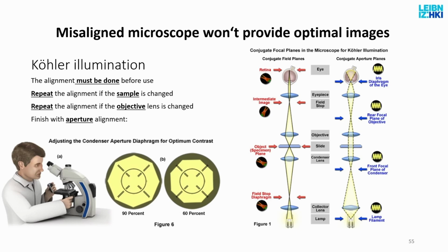So basically, the idea is that in transmitted light microscopy, the object is illuminated from one side and observed from the other side. So the light goes through this. That's the name. This is very useful when you have, for example, no labels, but you want to see the shape of the cell, nuclei, etc. Without labeling, then you take a transmitted light bright field image.